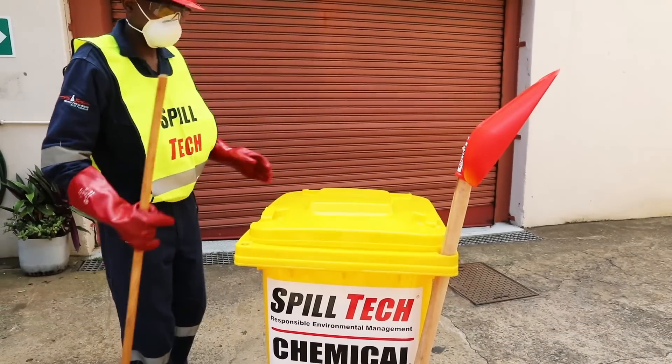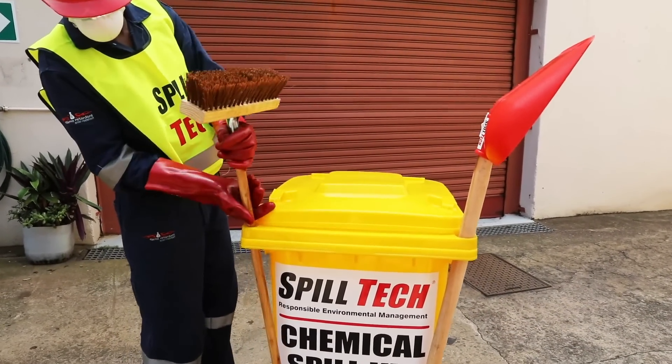Always make sure that your Spilltech bin is restocked so that you can deal with spills whenever they happen.